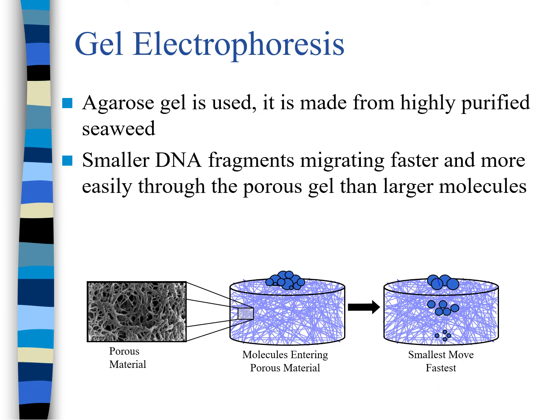So after agarose gel electrophoresis, what you will see is that we have different levels. The smaller ones move the most toward the positive charge. The larger ones will be stuck near the wells, the holes near the negative side. And then we have molecules that are in the middle between the smaller ones and the larger ones.